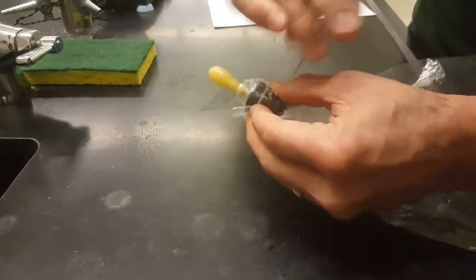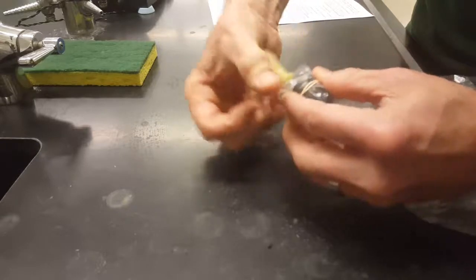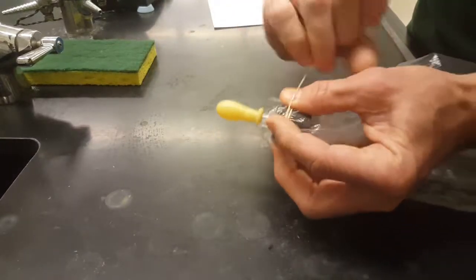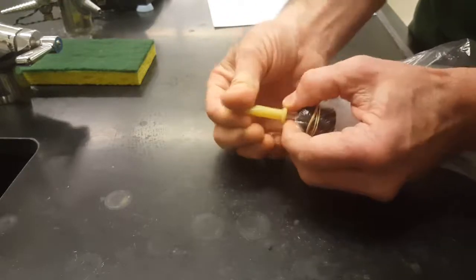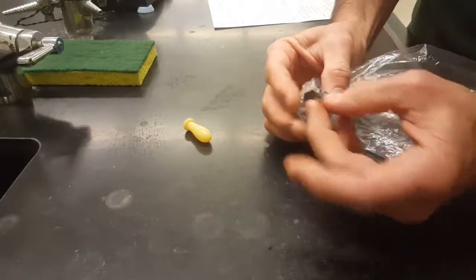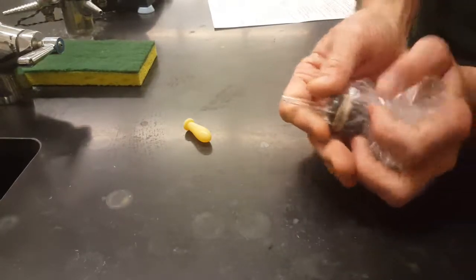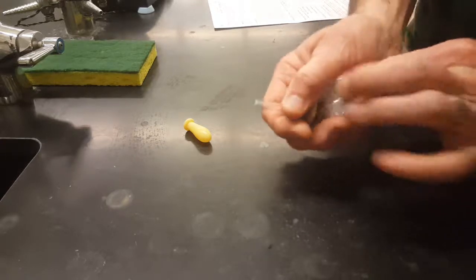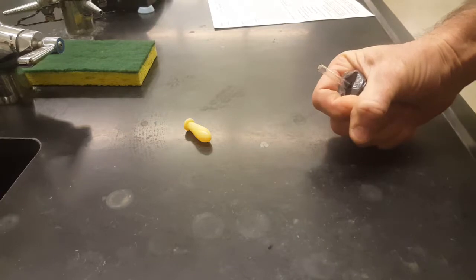And then grab that rubber band, get it as tight as possible, twist it, go back around, twist it, go back around. Your test to see if you've done this well is to take the bulb off the end of the glass cylinder and push all the air out. Does air exit your system completely and easily? If so, you've done a nice job.